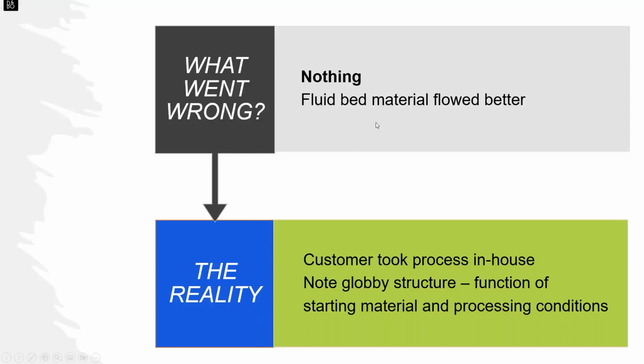So, it flowed better, it dissolved better. They took the process in-house, but that globby structure is really an indication that you're not quite on your game 100%, and you need to control your process conditions.